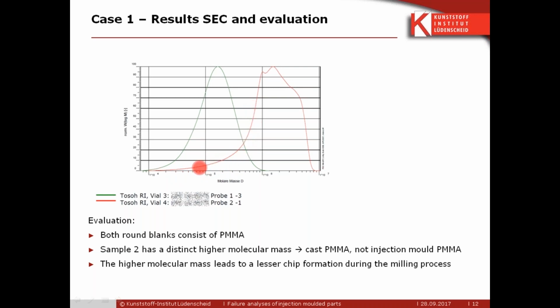Are you talking about the OK or NOK sample? Yes, you see the long tail here. That's also a hint, and you see the double peak here. And here's a third peak.